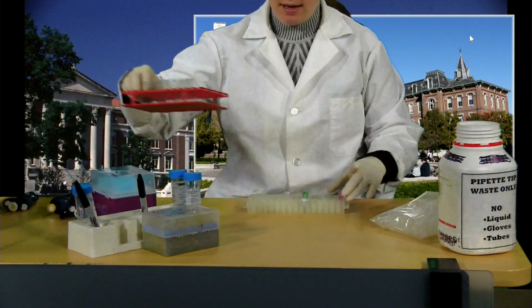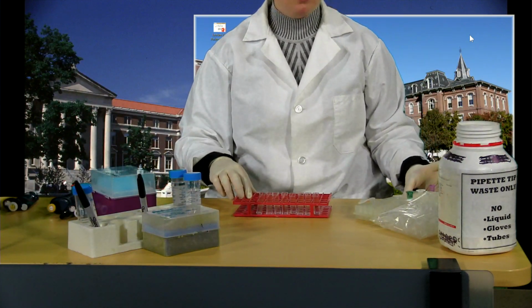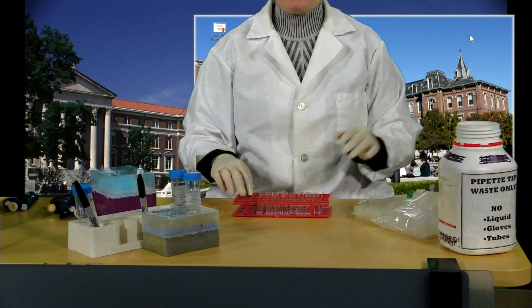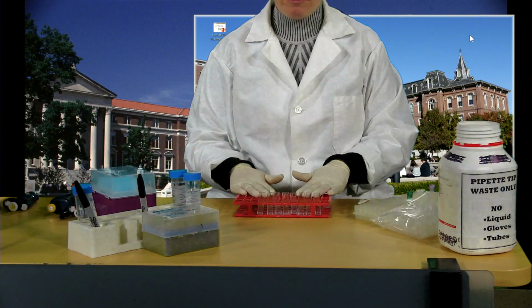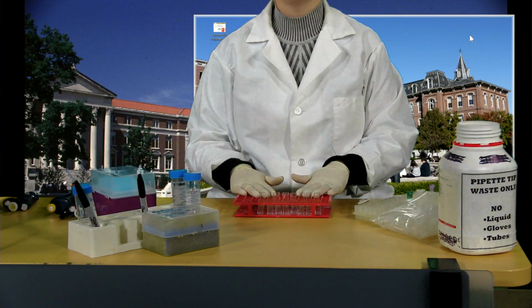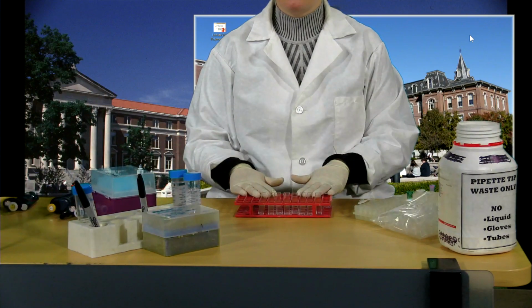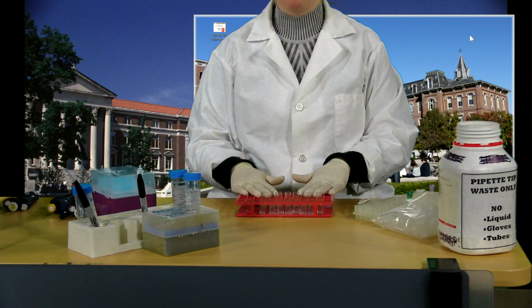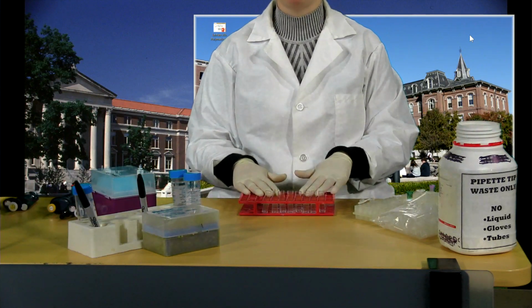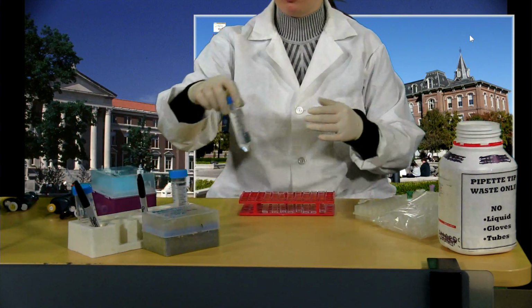Okay, so as this is incubating, I'm going to set up my cuvettes to be ready for when my assay is done. I want to be able to stop my assays after 5 minutes. As you guys know, the product p-nitrophenol that we're going to be measuring is not visible. It doesn't have absorbance within the visible spectrum at the pH at which the assay is conducted, which is pH 5. So we need to raise the pH, so we use stop solution for that.